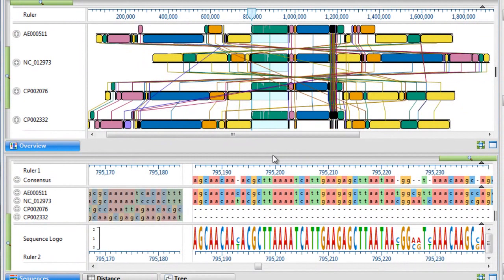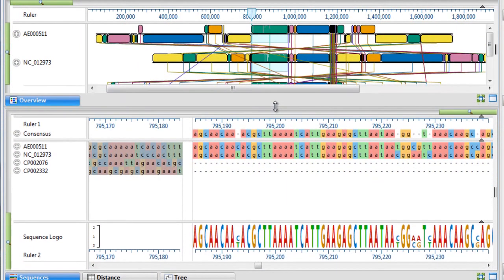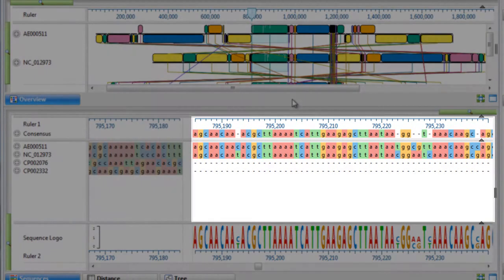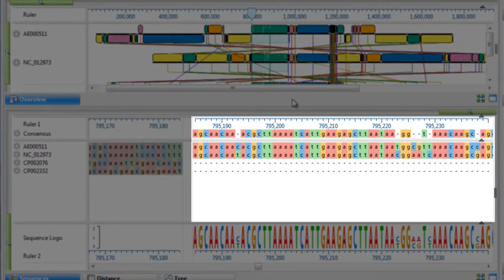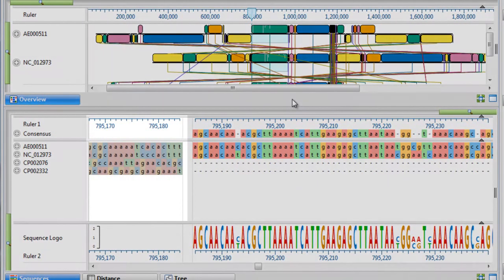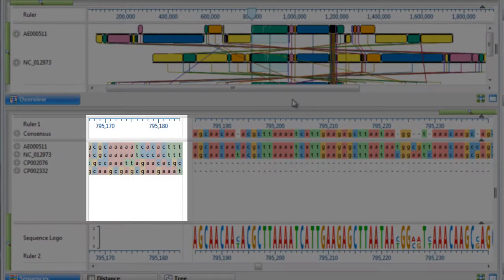We can then choose to examine the active block in the Sequence View. Residues for the active block in the Sequence View are shown in bright colors, while the flanking sequences in adjacent blocks appear dimmed.